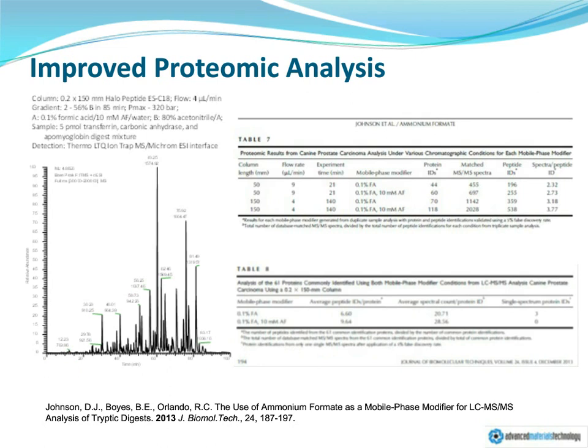The question became, and a driver for this was, well, since we're now improving peptide separations, will it have a net benefit on proteomic analysis? That is, the separation of a complex mixture of peptides.